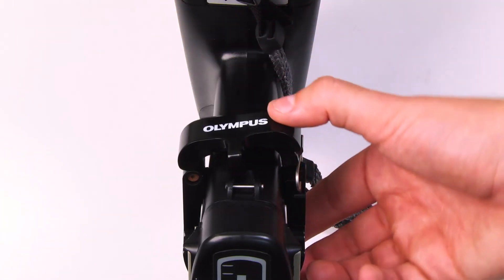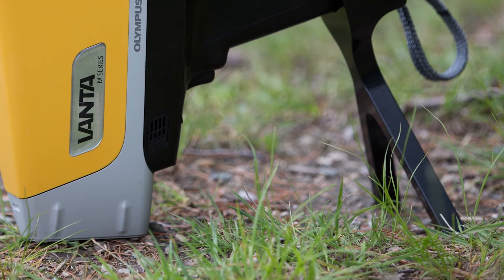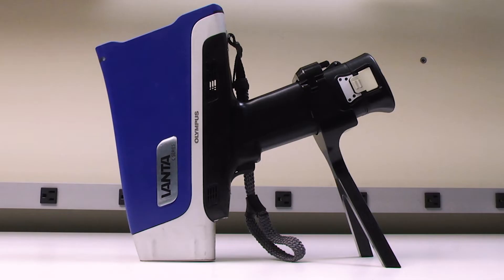Bring down the top piece and secure into place with the side clip. The legs of the soil foot should be flat on the testing surface. You are now ready to collect data using the soil foot.